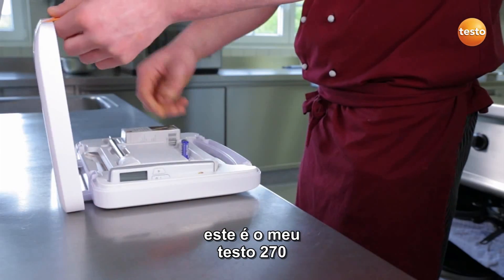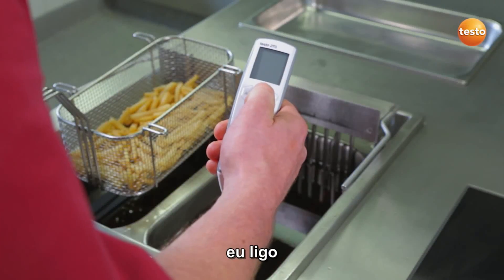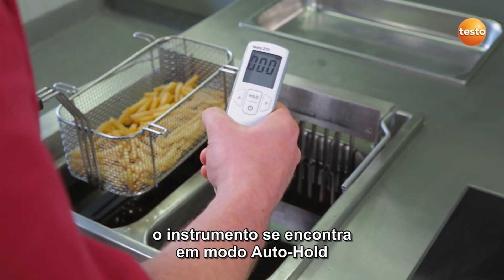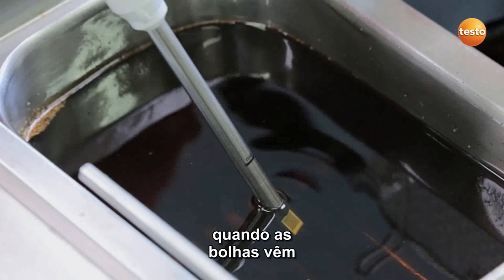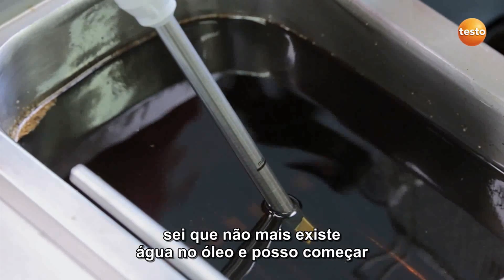This is my Testo 270. I switch it on. The cooking oil tester is in auto-hold mode, that makes the measurement easier. We are ready to go. When there are no more bubbles rising, I know that there is no water left in the oil, and I can start.